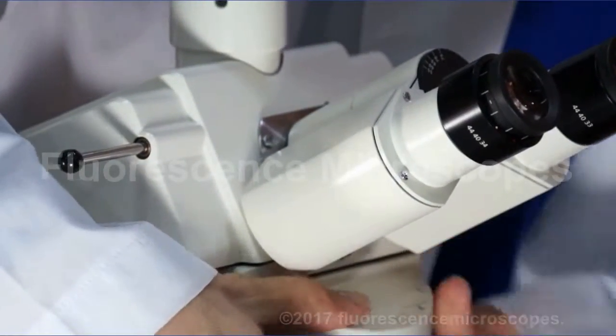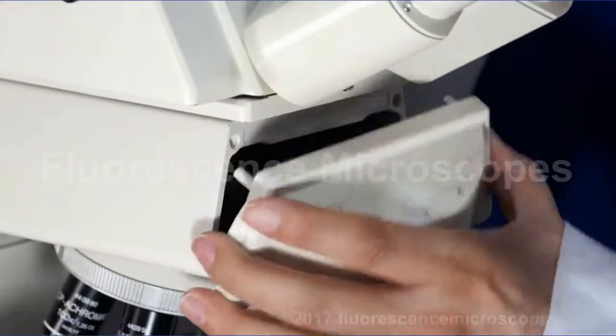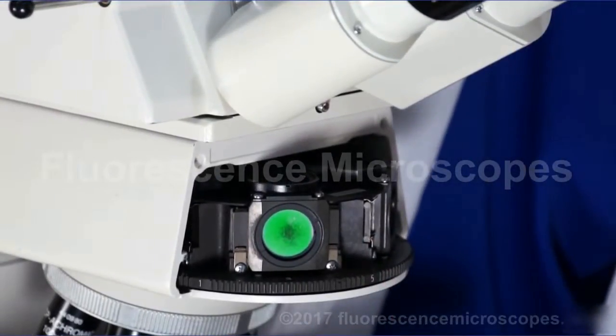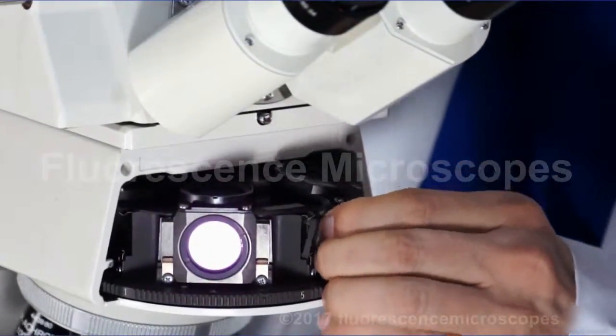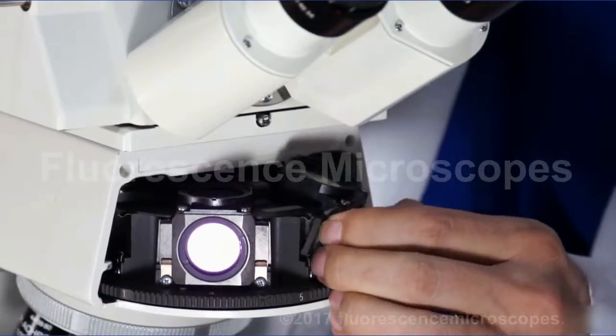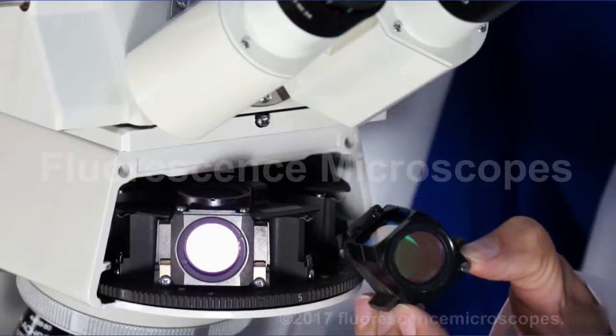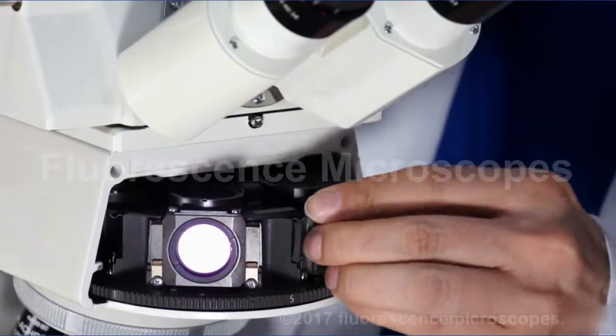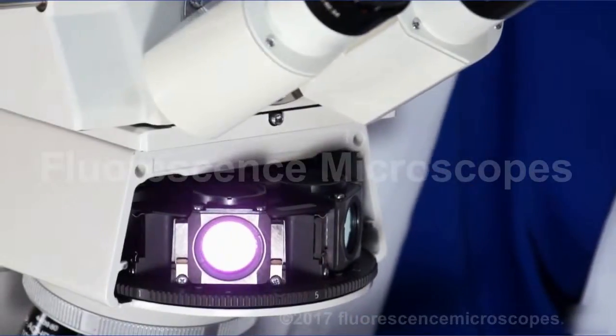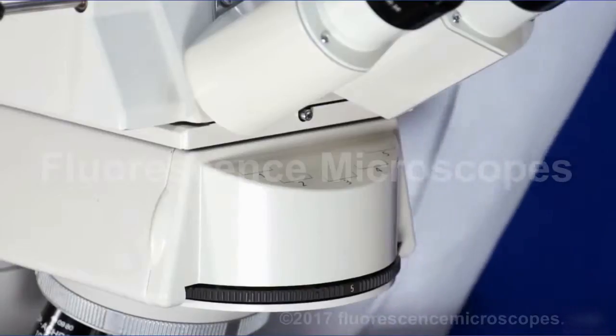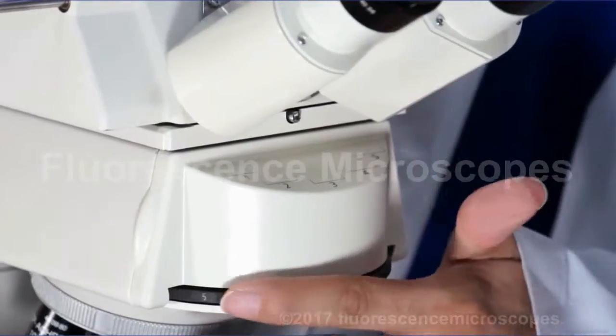Your filter cubes are inside. And it's easy to pull them out. They're the newer version, push and click. We've also labeled each cube as to what it is, so you know the wavelengths. You can change the filter cube by turning this knob.